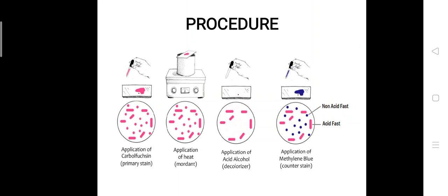Now you have to cover the smear with three percent acid alcohol for five minutes or until the smear is sufficiently decolorized, that is they look pale or pink. Now you have to wash your slide again with clean water or under the running tap water. Then cover the smear with malachite green or methylene blue for one to two minutes, using the longer time when the smear is thin.